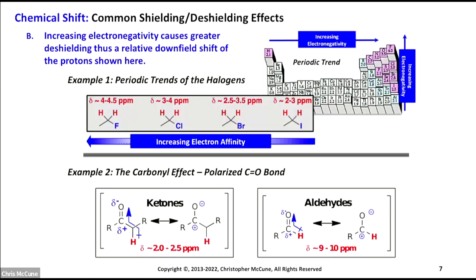So one would expect that the hydrogens on the carbon are more deshielded because of the fluorine versus less deshielded because of the iodine, because fluorine's more electronegative than iodine. The trends here are pretty true. There's a little bit of overlap here and there, but we go from 2 to roughly 3 on average to 3.5 to 4.5 as we go up the trend line.